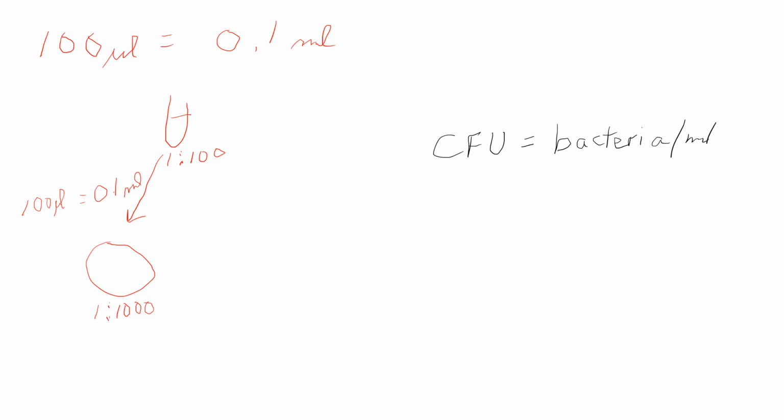So the first question on page 3 is just asking, using the plate counts from that usable set, figure out how many bacteria you had. So remember, just as an example, this is not the answer to the problem on your page, but just as an example. Let's say on this plate right here, let's say we had counted the number of colonies and you ended up with, let's just say 147 colonies on this plate.